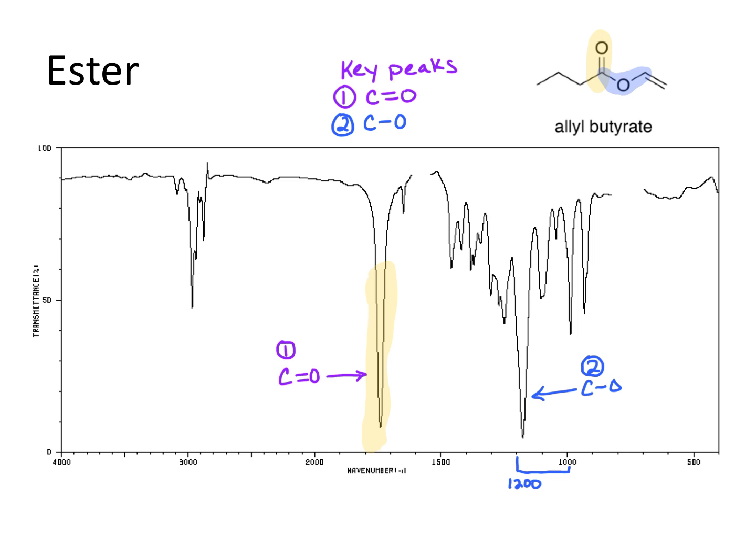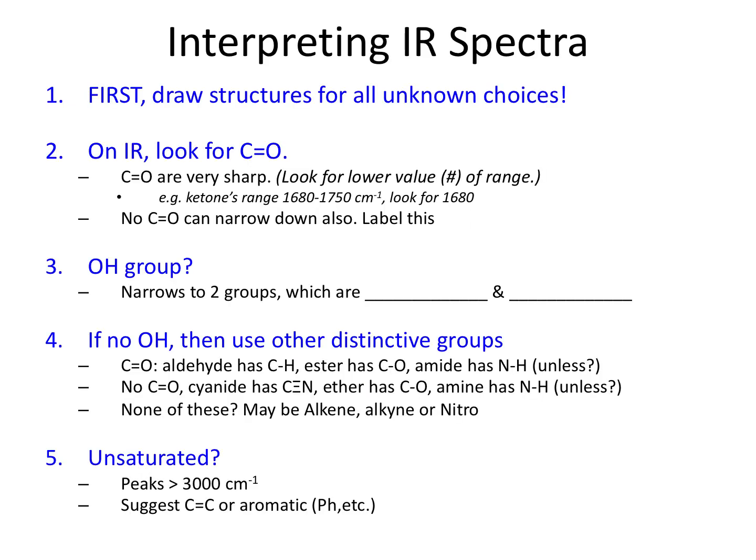Perfect. All right, so that's all the functional groups that you have to know for this class. I just gave lots of examples so that you could point them out on a picture. If you have a handout, you can match it to that, and then you'll have all the information you need. Now, as I said before, if it's an intro chemistry class, you're not going to have to identify much based on the IRs. If you think you know what it is, you're going to look at the shape of the molecule and see if you can confirm that that's what it is. Like if we're doing an experiment where we're isolating special things from spices, we'll look at the functional groups that we think they are from the pictures. We'll find the key peaks that we are expecting, and then we'll look and see if that matches what we found. That's how we'll know if it's the right compound.